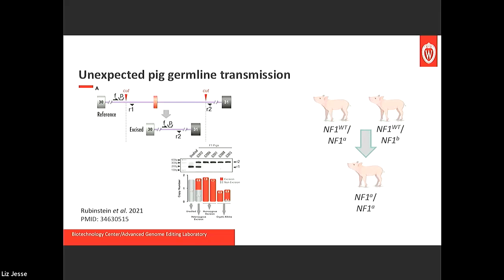And when we just do the simple PCR, we saw some that carry a couple different bands, so they had excised and non-excised. And here's an example of 4 where, with just conventional PCR, you run a gel, and we saw that these 4 samples here only gave us the excision size band. So what we would consider as homozygous for the excision.